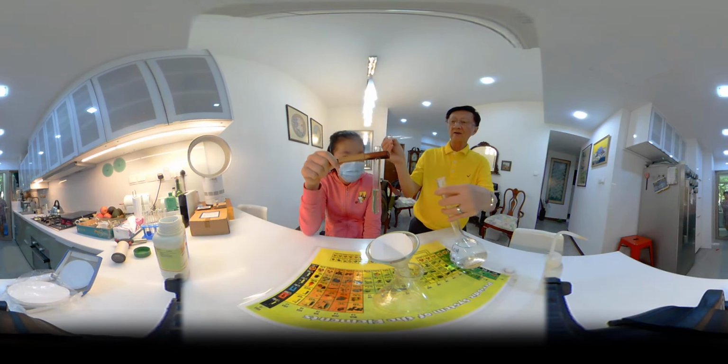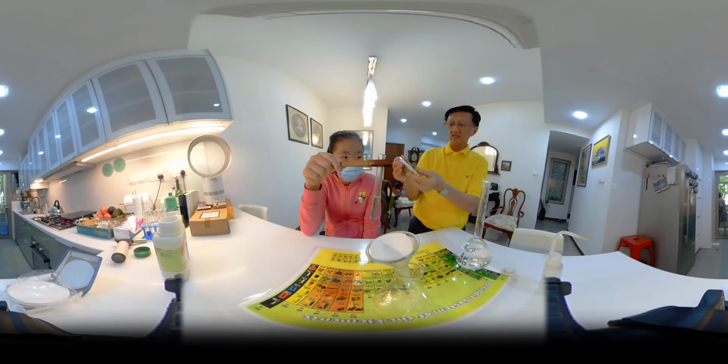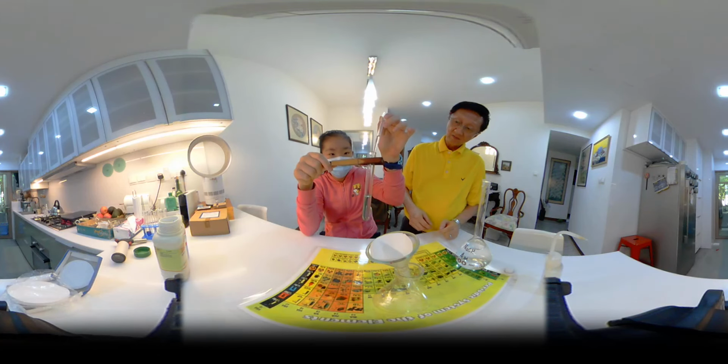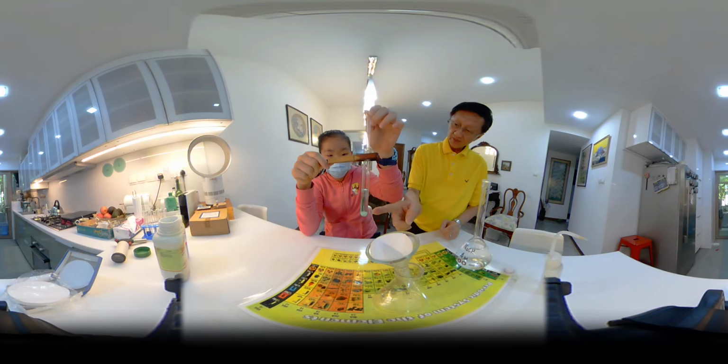Okay. Take this and drop in. What do you see? You see precipitate, right?